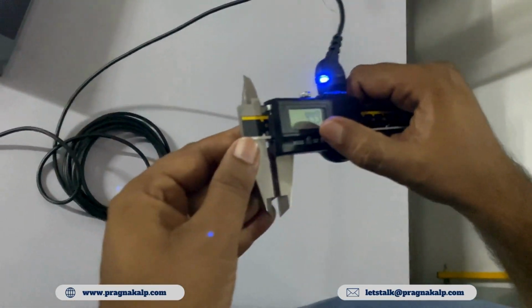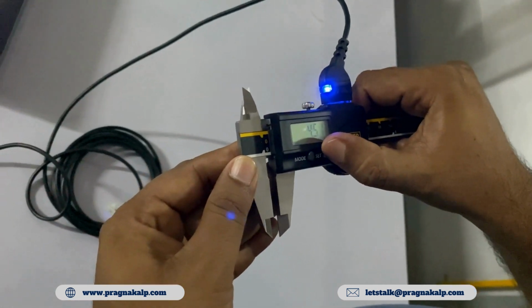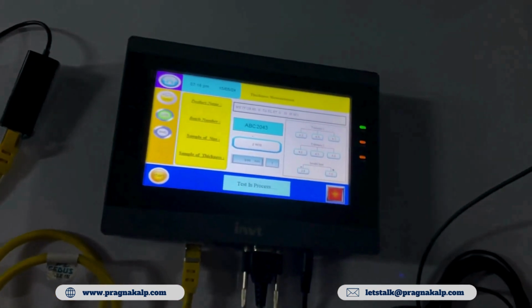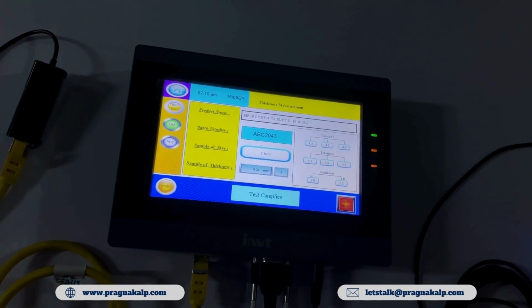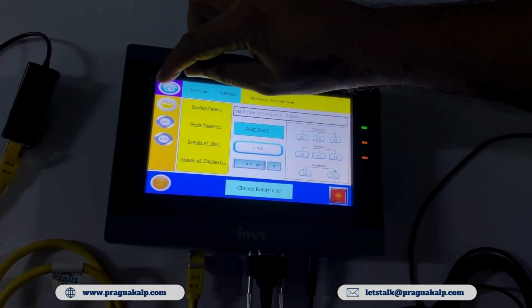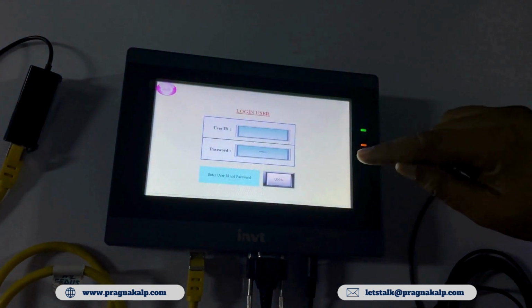During the process, data will be collected from the instrument. After completion, a report will be generated, and a message indicating complies or non-complies will be displayed on the interface. Finally, the user will log out from the interface.